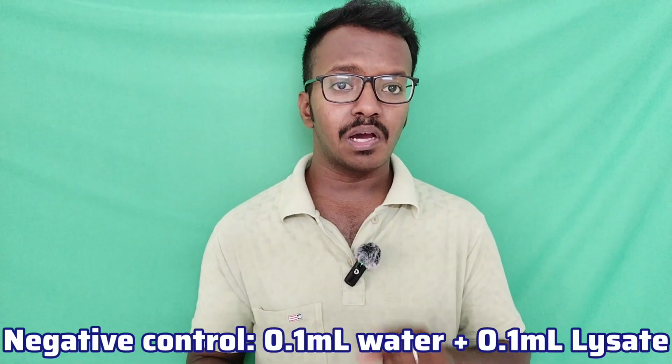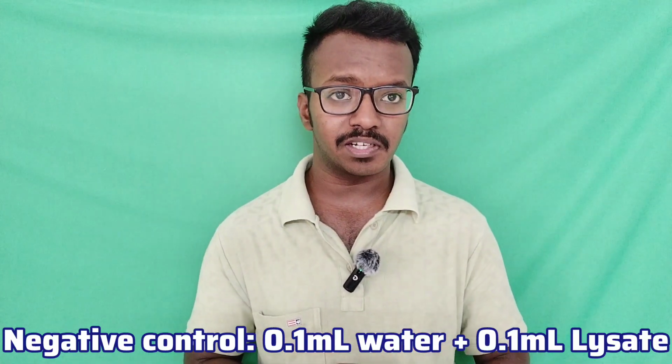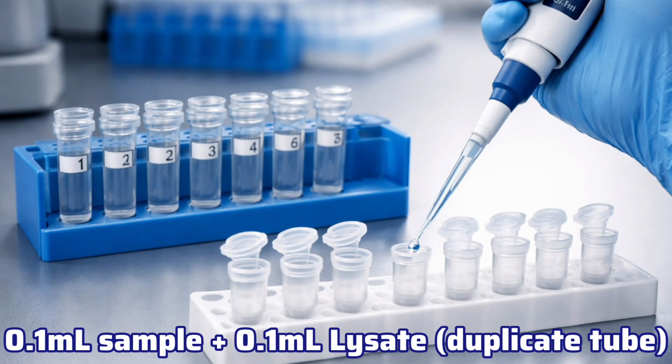For the negative control, 0.1 ml of endotoxin free water is mixed with 0.1 ml of lysate. We have 8 baked exposed vials. Transfer 0.1 ml of sample from each vial individually to 8 fresh tubes and add 0.1 ml of lysate to all tubes. For each vial, we need to use 2 tubes, so totally 16 tubes.